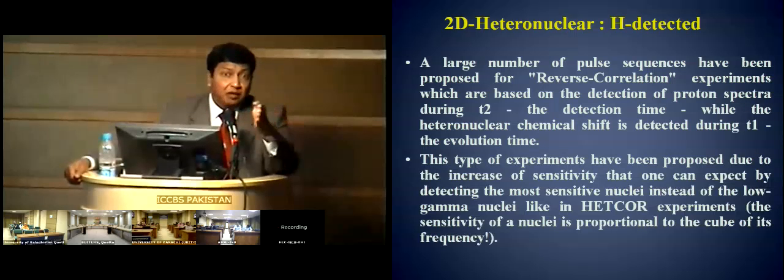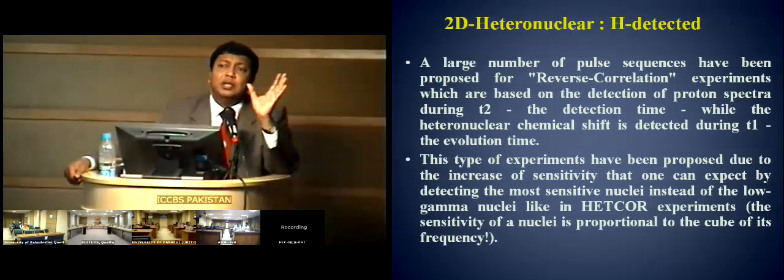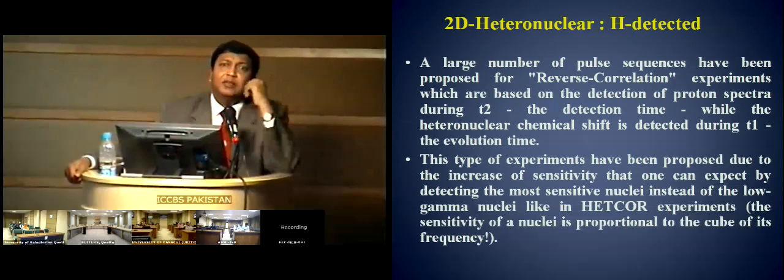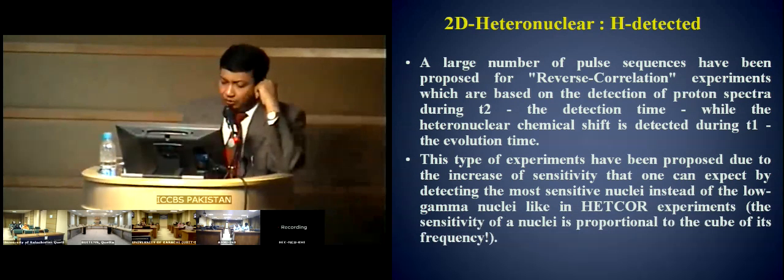There are pulses. Always remember you can have pulses and you can also have just no pulses. But what you do is that at the end of the T1, you treat them by a particular pulse sequence or a time delay to magnify the effect of what has actually happened during the T1.